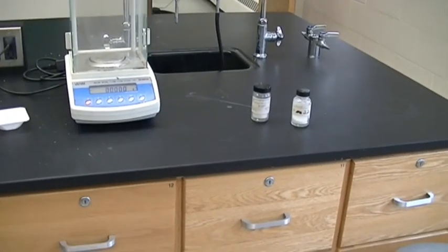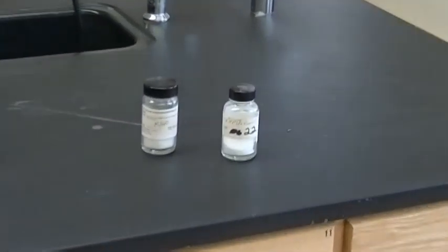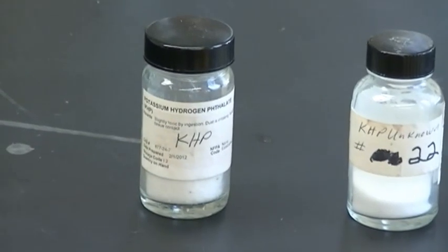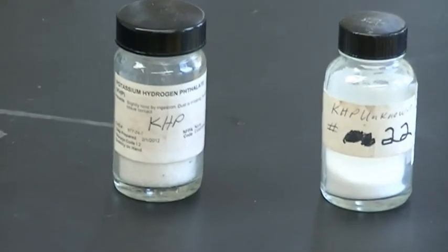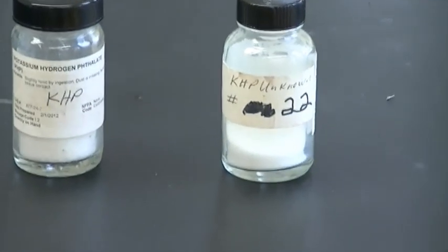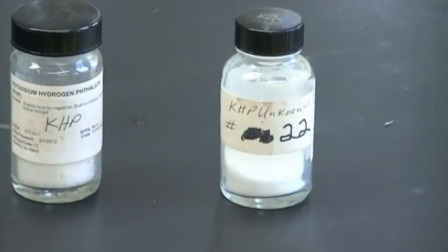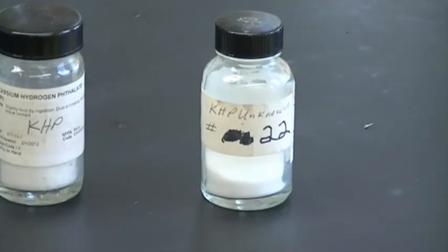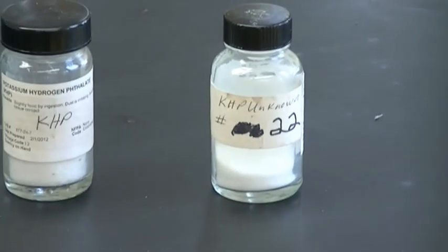All right, the next titration is going to be with KHP. Here we have 2 bottles of KHP. One on the left here is pure KHP. It's 100% KHP. The one on the right is an unknown KHP. We are going to calculate the percentage of this KHP by doing a titration. The unknown number in this case is number 22.